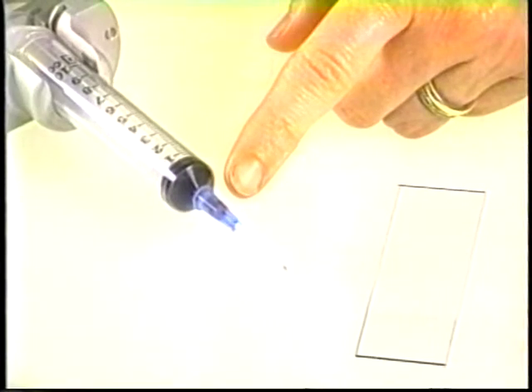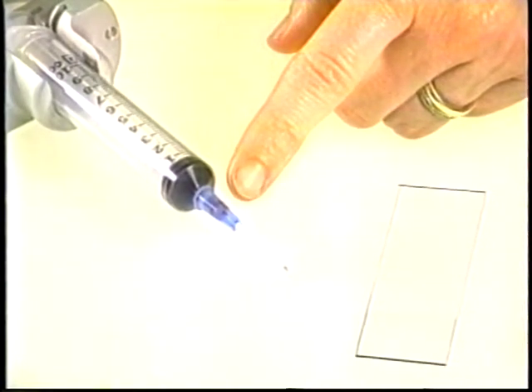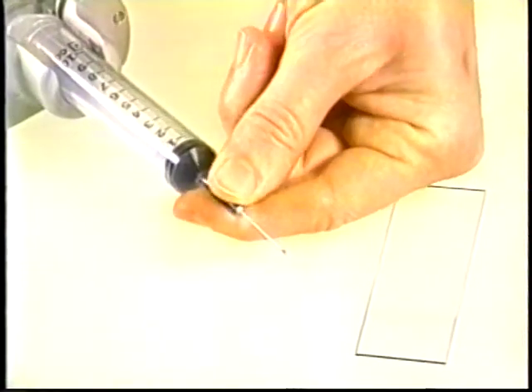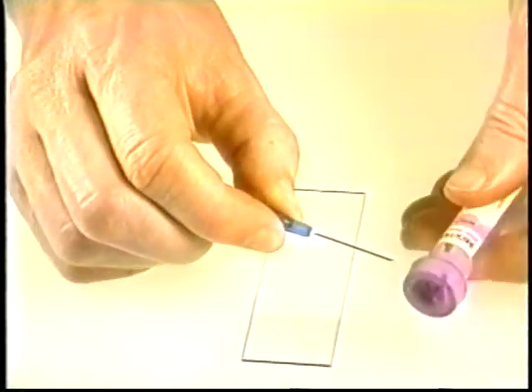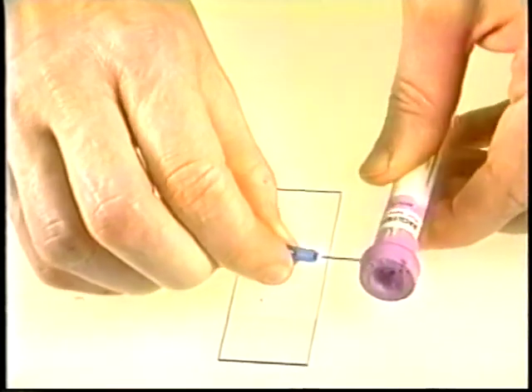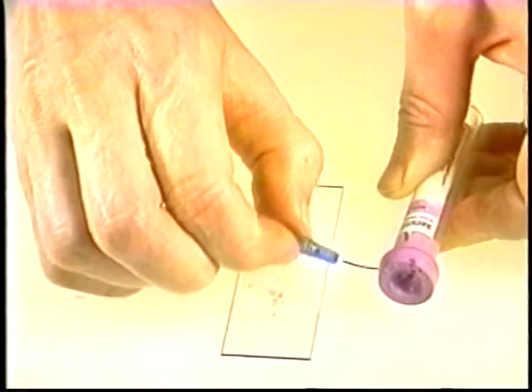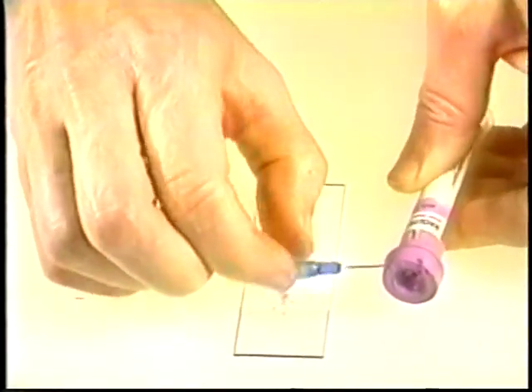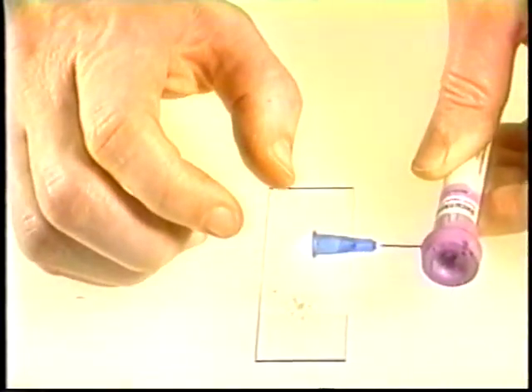Sometimes the best part of the harvest is trapped in the hub of the needle. This may be rinsed out or used for cytocentrifugation or a cell button. It can also be used for smearing. The material can be extracted from the hub by securing the needle in the rubber top of a vacutainer tube and then flipping the hub onto the slide repeatedly in this fashion. Most of the trapped harvest will land as droplets on the slide and are ready to smear.